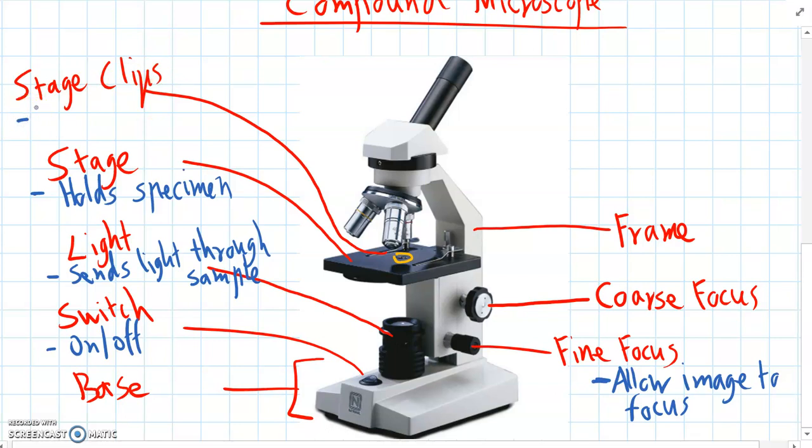So the stage clips secure the specimen so it doesn't move around. Because it needs to hold perfectly still when we focus in.